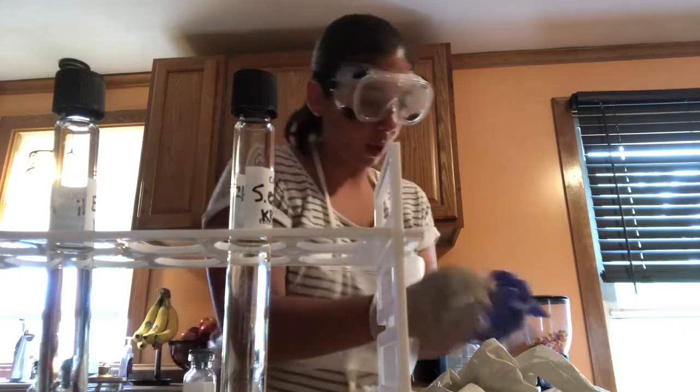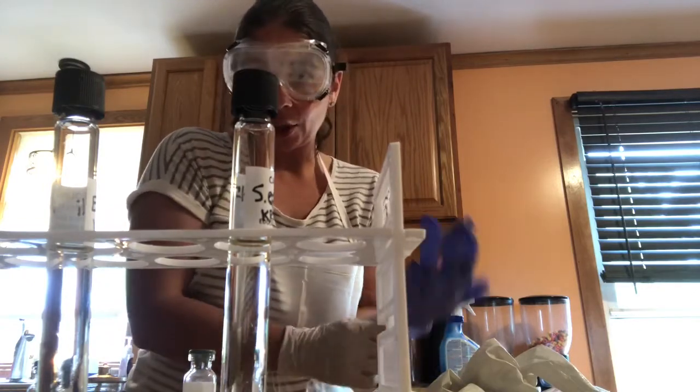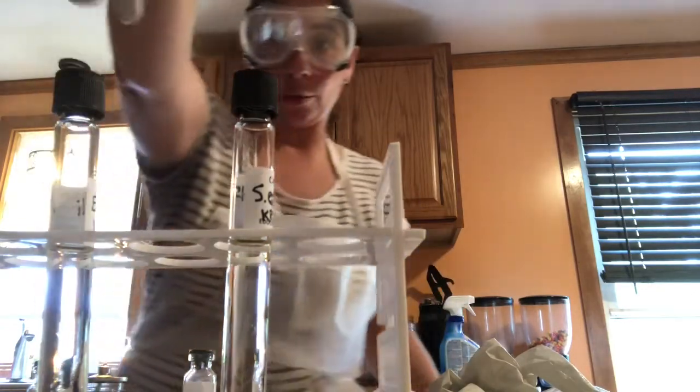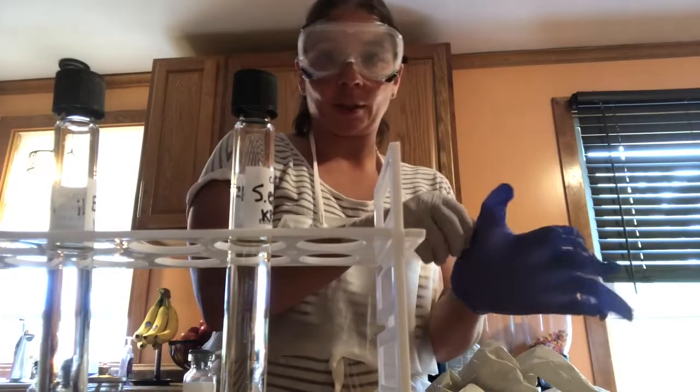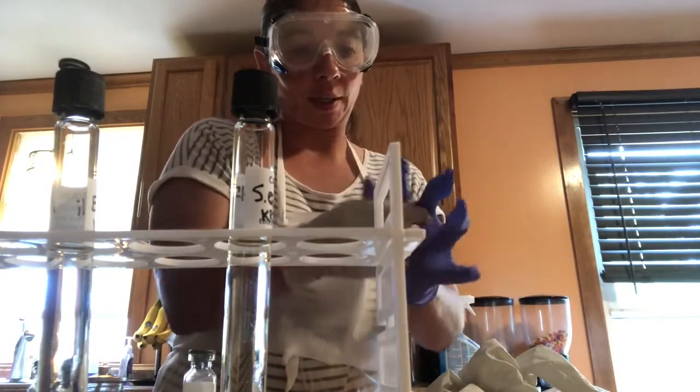Okay, but as we go on here, remember from the first or second time that you did this, you're going to take your uninoculated new tubes of nutrient broth, right? And you're going to suck up about 1 ml, whatever fills up. Sorry, my hands are so sweaty I can't get the glove on.